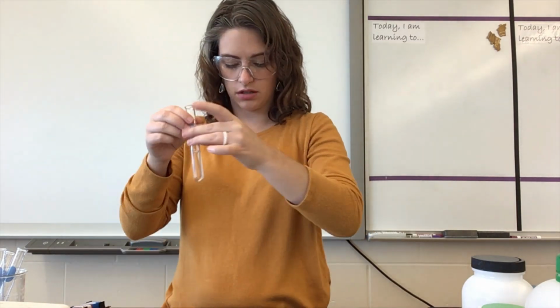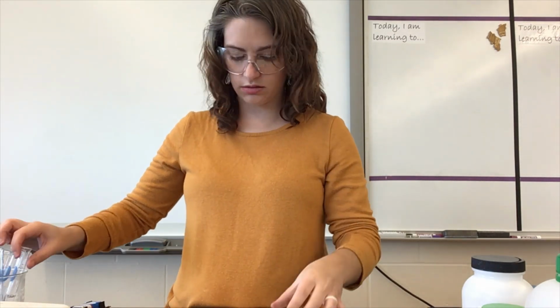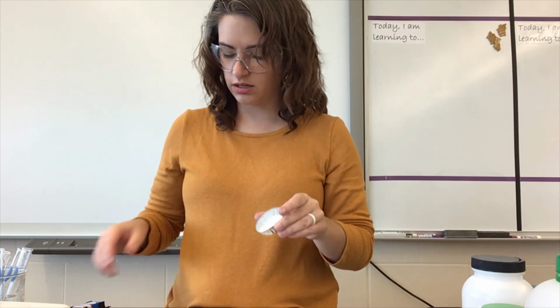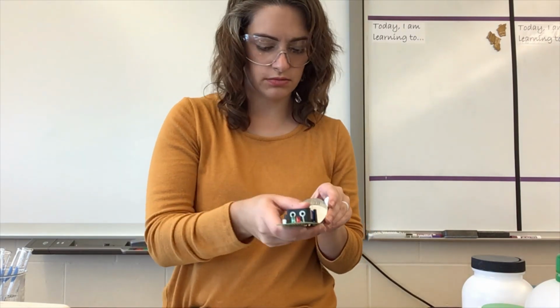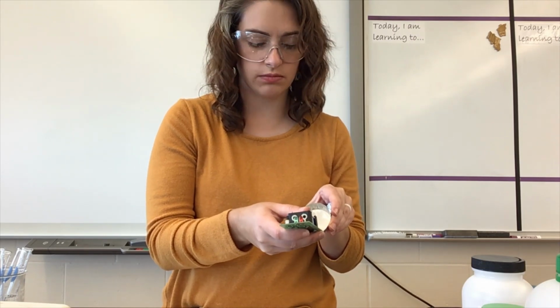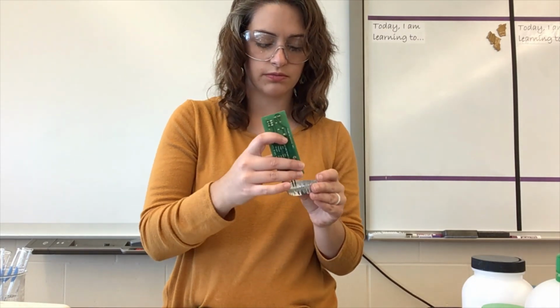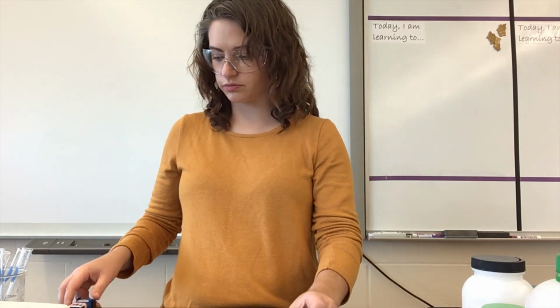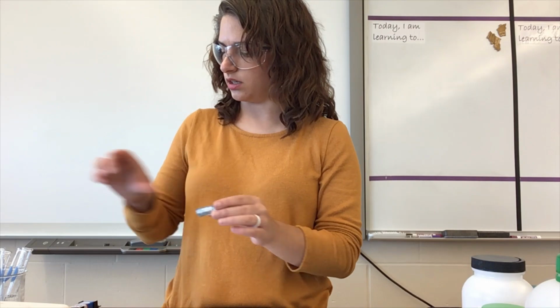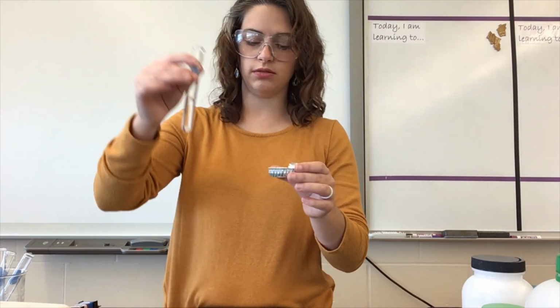Okay, conductivity. So we'll test it as a solid. Nope, no light, not conductive. And then we'll test it in solution.